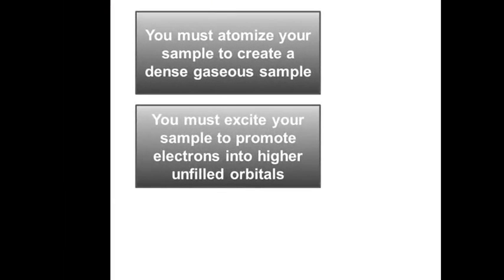You're going to have to excite your sample. This is a really important part of AES, and in fact the term inductively coupled plasma is exactly this piece. In AES, you're really watching the excited states of atoms go back to the ground state. In absorption, what we just talked about, you're watching the ground state go up to the excited state. So that's a really big difference.